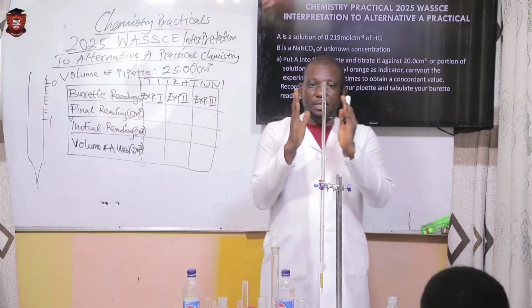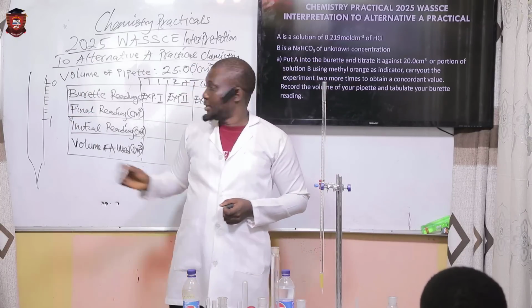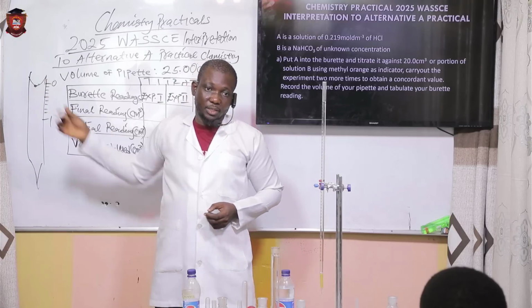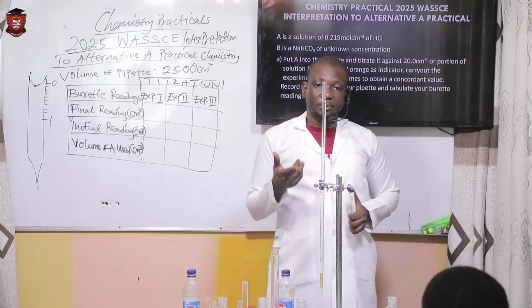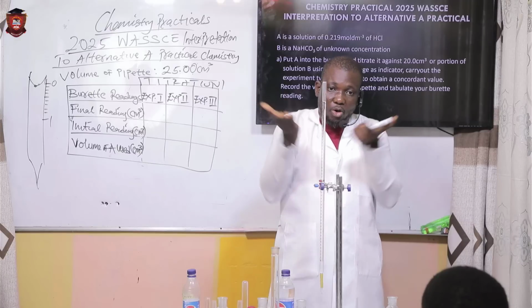when you have a narrow flask like this, with a liquid inside, the liquid will always have a curve. The liquid will always have this kind of curve. This curve is called the meniscus, most especially the bottom of it. That is how you take your reading, from the meniscus. Meniscus means the lower part of the curve of the liquid.